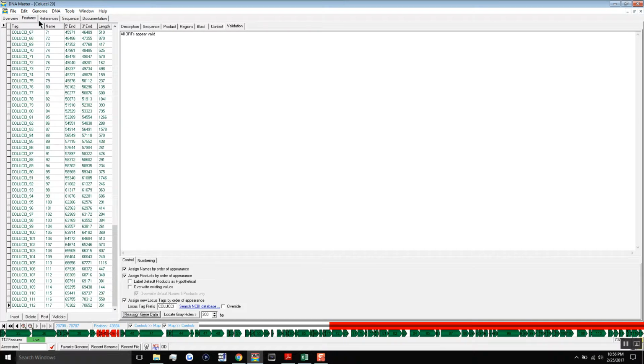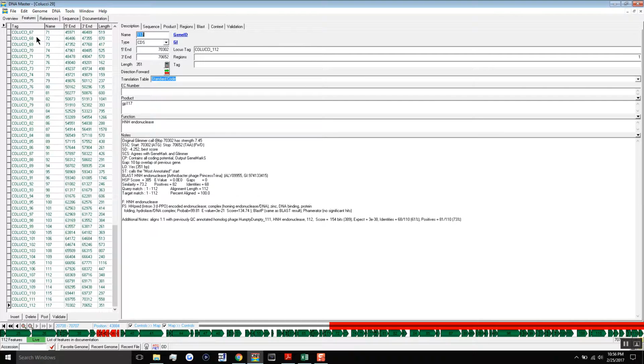We can head back into the description here. The next step in preparing your final files is to make sure that if you merged files, the merging feature was added so that work could be split up over a group of people. So for example, let's say a class wanted to do a whole genome and they were each assigned 5 genes or something like that. It would be easier to combine the DNA Master files into one file and combine everyone's work into one final project.